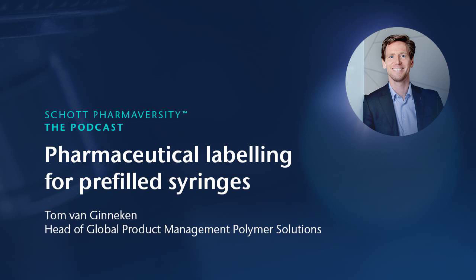Okay, I can see the difference. Yeah, that's true. Well, you mentioned the components just shortly before. So there's one thing that I was thinking about as well, and it is more about the glue that you use to bring the labels on top of the container. Can the combination of the glue and the label have any kind of negative impact on the drug stability?